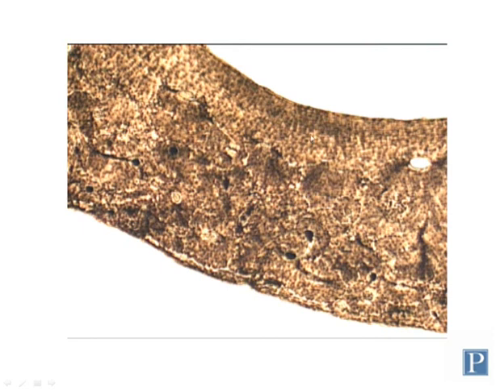And there are two types of lamellae that you can see on the slide. In addition to the concentric lamellae, you have what's called inner circumferential lamellae, that surround the marrow cavity. So this is where the marrow cavity would be in the long bone. But again, you don't see anything here because all of that soft living tissue has died.